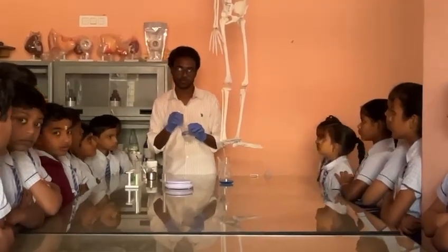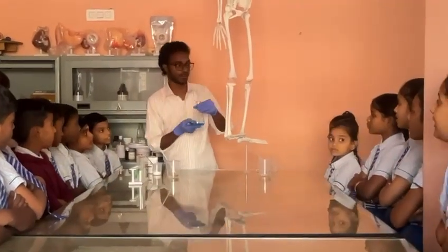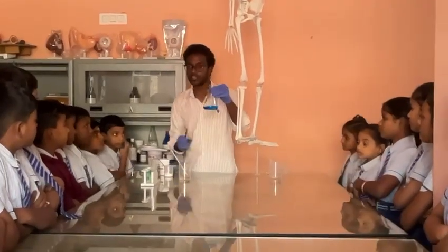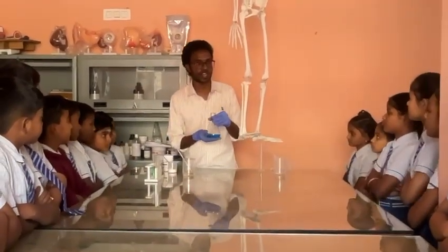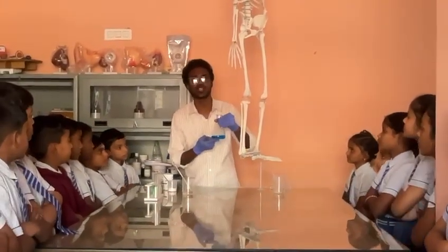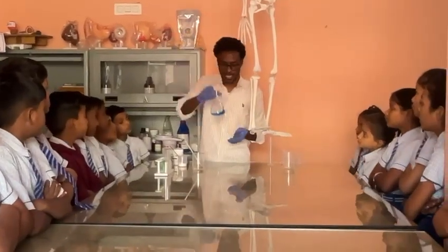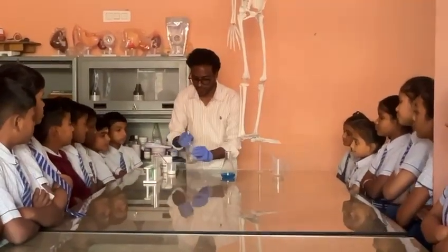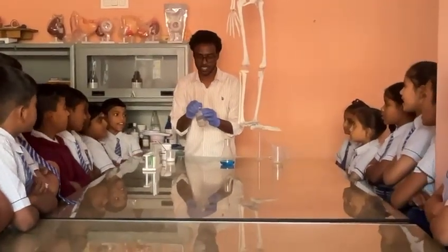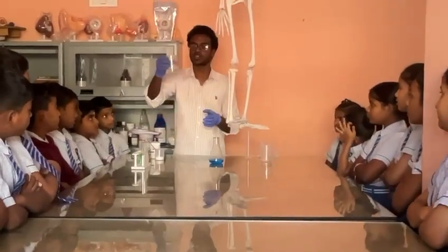So students, now we have made the solution of copper sulfate. We took some powder of copper sulfate and mixed it with water. So we now have copper sulfate solution. Which color is this one? Blue color. Can you see the color? And here in the beaker we have NaCl solution. NaCl is also called common salt.